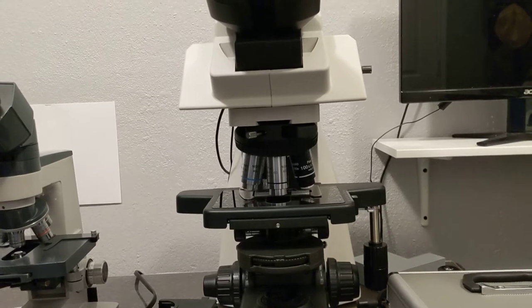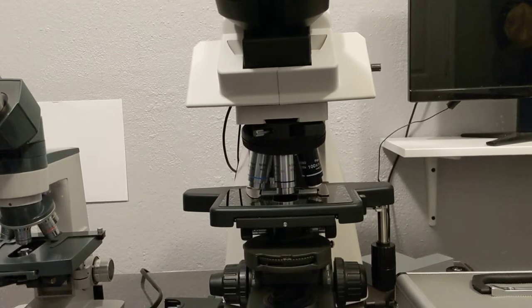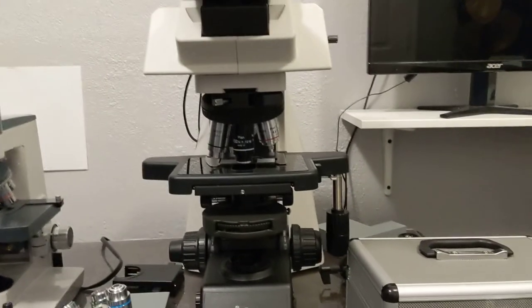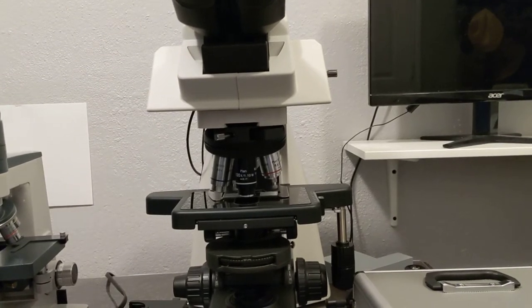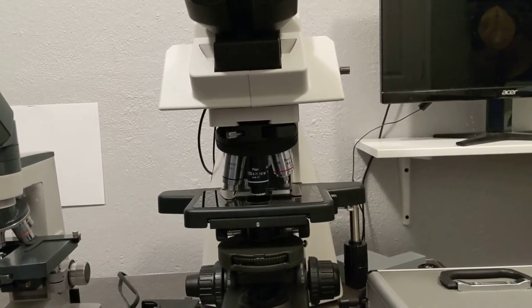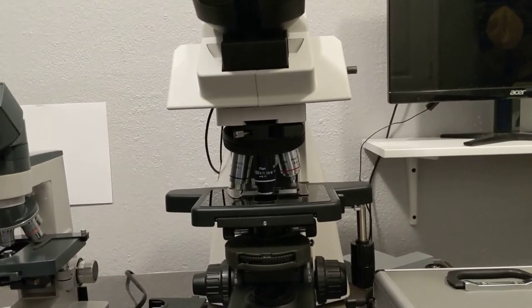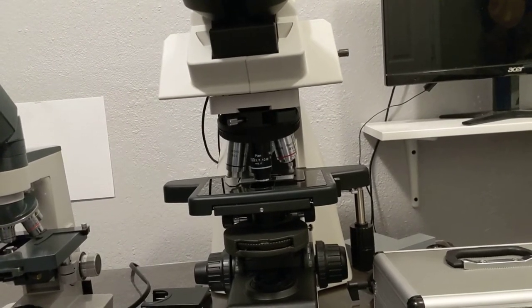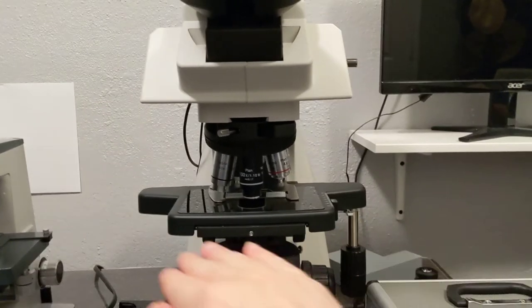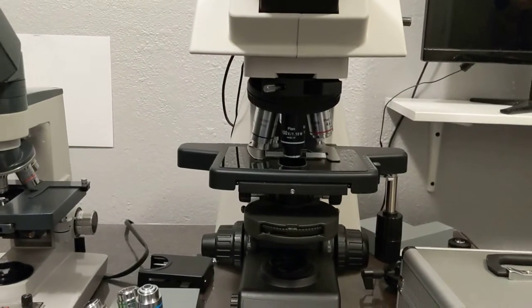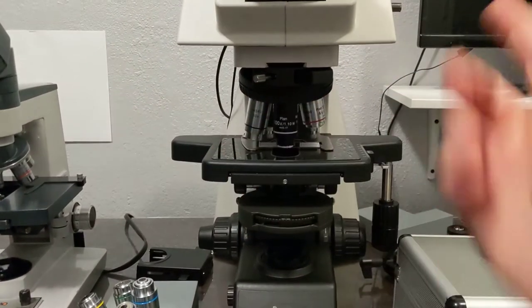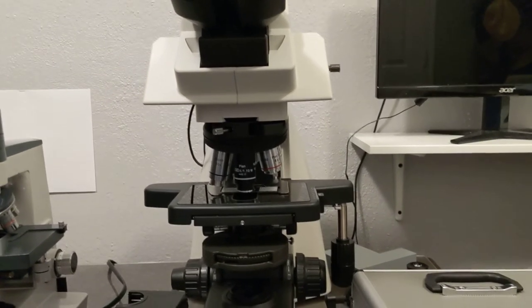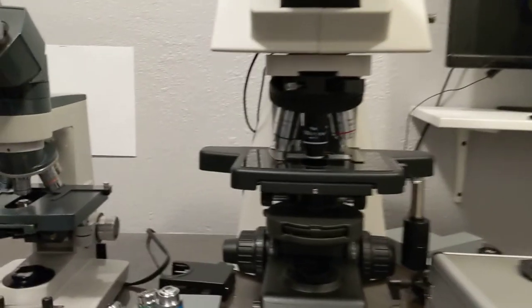For the 100X, I really hate using oil. So I bought a 100X water immersion. This is not fluorite, it's just achromat. I hadn't really used water immersion before, but man, I love it. It's just so much easier than oil. I keep a little dropper next to the microscope and put one drop of distilled water on my slides when I want to use 100X. It's beautiful. When you move the stage around, it doesn't drag the slide cover with it like oil sometimes does. I would like to have a fluorite or Apo, but best scope doesn't make them. If you buy one from Nikon, you're going to have to mortgage your house.